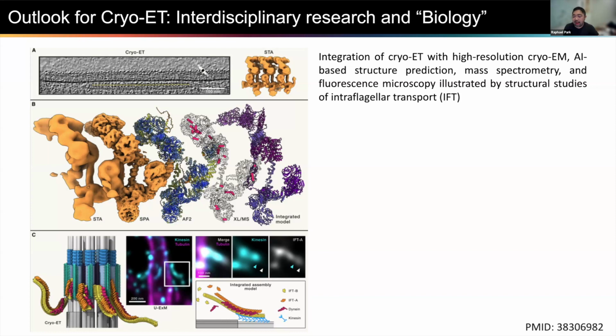And I mentioned biology here because this is really my personal experience. When I talk to many people who start cryo-ET or cryo milling, everyone shares the same idea that once you get your image, it's beautiful, but oftentimes we don't know what's going on.